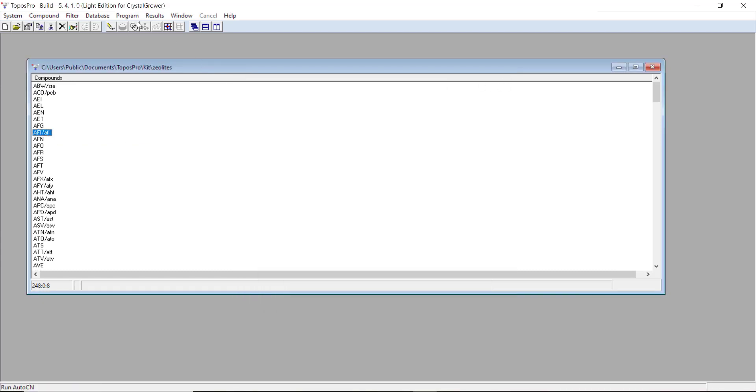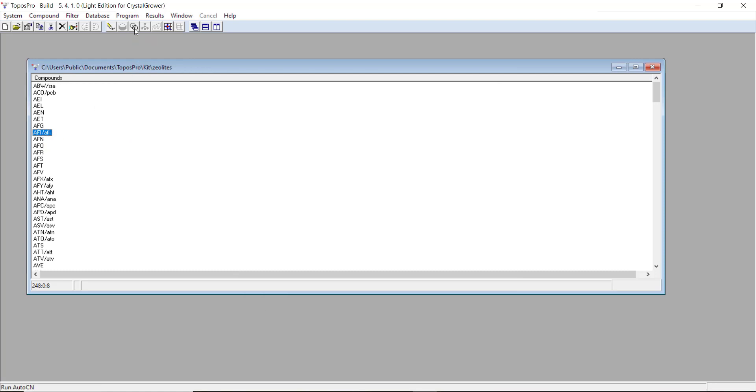You'll need to generate your adjacency matrix, which you'll do using AutoCN, which is this overlapping circle icon here on the toolbar. This is covered in a lot of detail in the next series of videos.